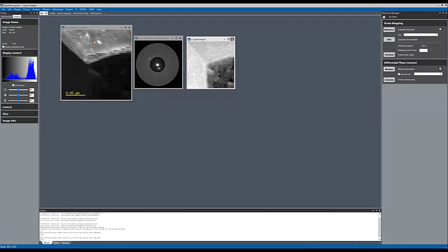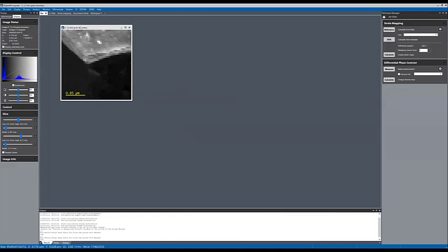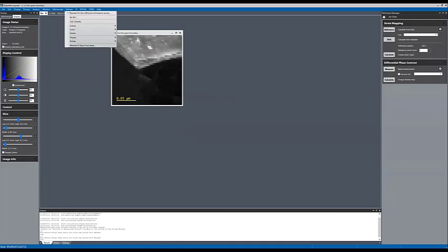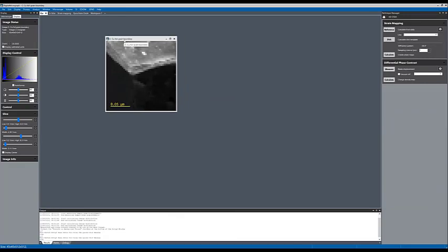Because I'm just showing you the basics here, another tool that you have for 4D STEM data processing in Digital Micrograph is under the volume menu. Roberto showed you that when you are collecting the data, there are multiple ways to reduce the data size. You can either select binning on the camera, or in the case of the K3, sub area and binning on the camera.